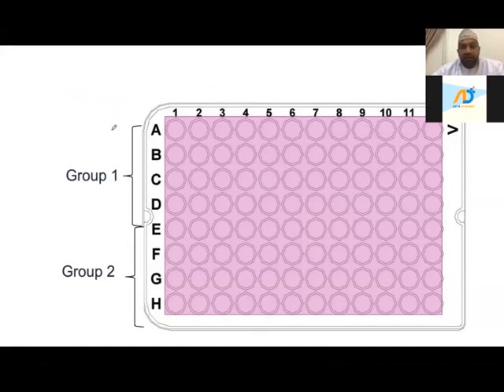Now, in this example, I have so many samples. Group number 1, I have around 48 samples. Group number 2, I have 48 samples. 24 samples, because I'm running in duplicates. So let's say 24 samples. If you have so many samples, you have a study where your sample number is too high. In this case, I can only run one gene. Whenever I say one gene, I mean one primer, okay? Because remember, one master mix means one primer.